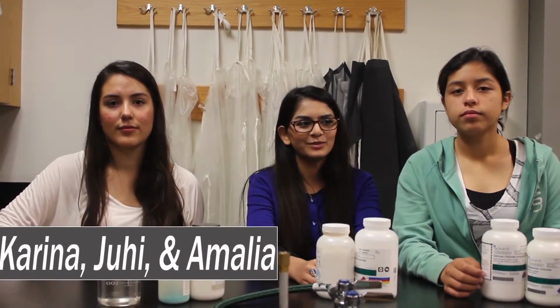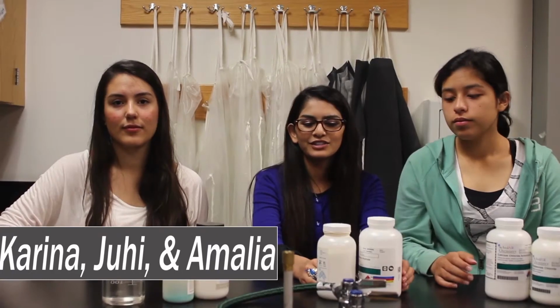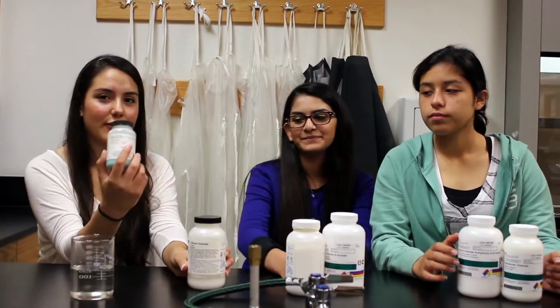Today we're going to be conducting the flame test lab by using compounds such as strontium chloride and sodium chloride, calcium chloride and potassium chloride, lithium chloride and cupric chloride.